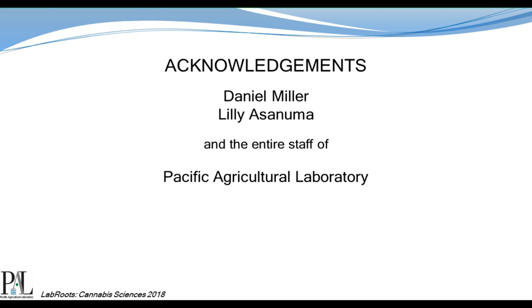Can you comment on the California list? Do you see potential problems if analyzed completely by LC triple quad? It looks to me like you should be able to do the California list on the LC only, but it is certainly not going to be optimized. For example, Coumaphos and PCNB can be problematic compounds on the LC, but they should perform very, very well on the GC. It also matters if you're just trying to hit state action levels, or if you're really trying to get to a low LOQ, like in our case, 0.1.